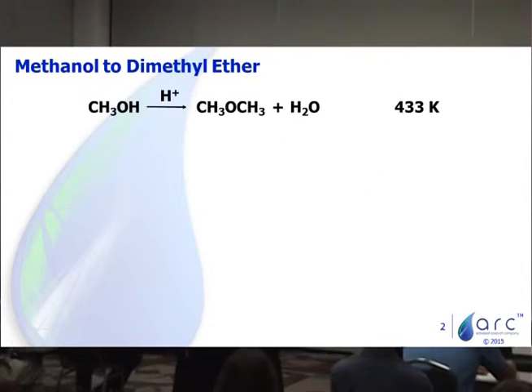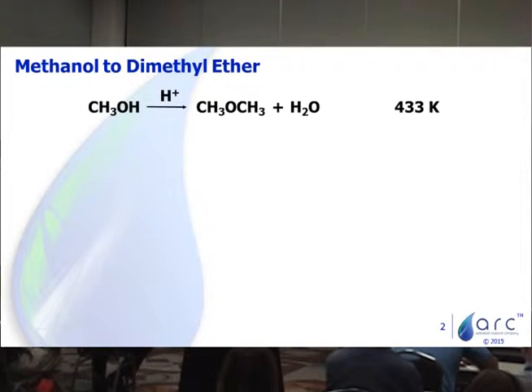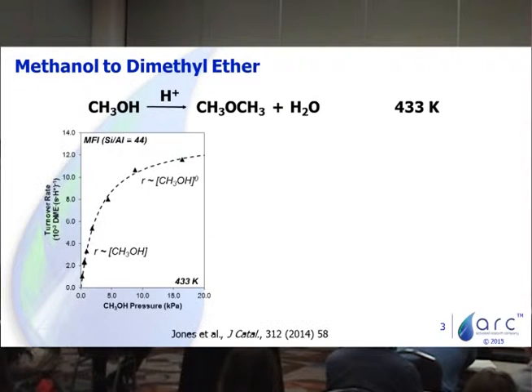Now, the motivation for this technology begins back when I was a graduate student at the University of California, Berkeley, and I was looking at methanol dehydration to dimethyl ether on solid acid catalysts. Now, in order to measure the kinetics of this methanol dehydration to dimethyl ether, which I'm showing here is the turnover rate as a function of the methanol pressure, I had to be able to accurately measure the concentrations of methanol and dimethyl ether.